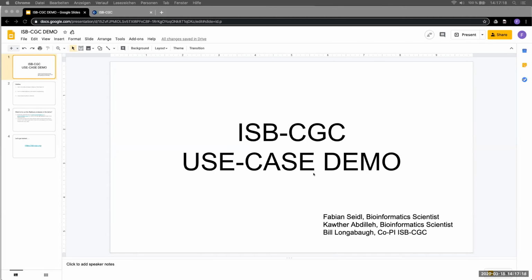Okay, so hey, I'm Fabian from the ISB CGC, and we're going to be demoing what we've been working on recently. We're trying to focus mostly on data discovery and data access, making that easy for researchers, and specifically some of the more downstream omics derived data. And so I'll have a use case demo.